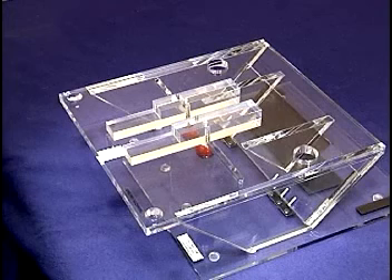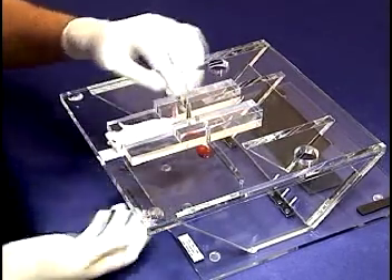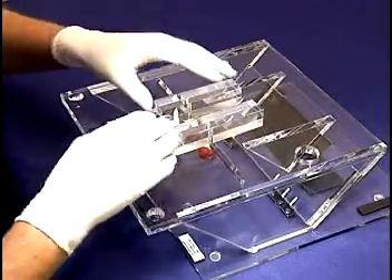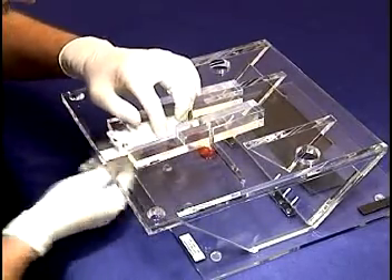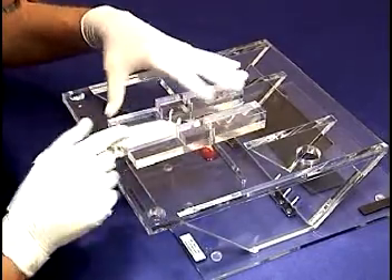Now we are ready to intubate. A relatively deep plane of anesthesia is essential for safe intubation. The mouse is placed supine on the intubation stand. Care in positioning is important because if the mouse is rotated to the right or left, intubation becomes much more difficult.